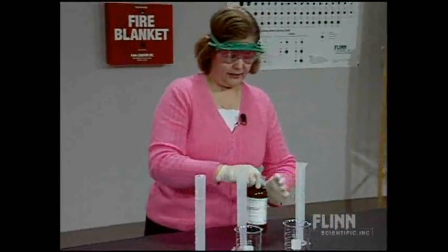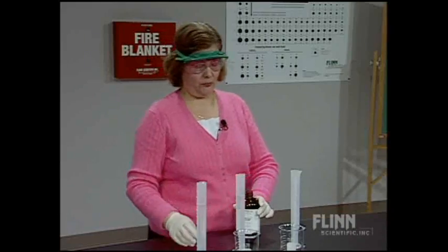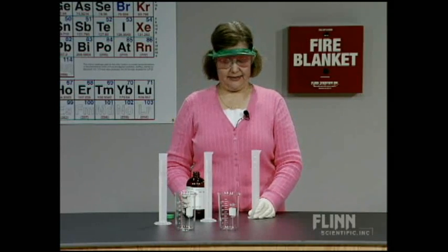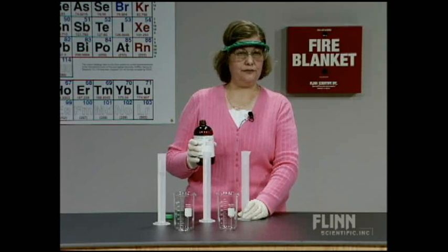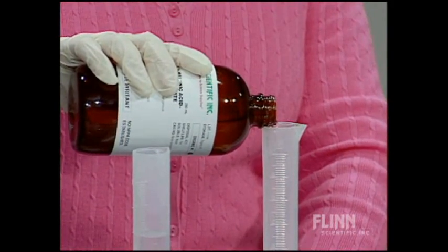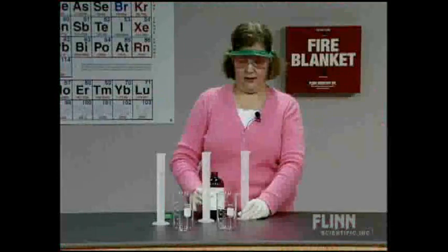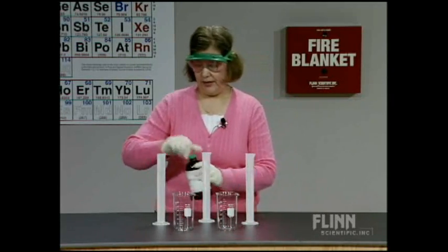And then my third reactant is actually a mixture. It has some starch in it, so that might give you a clue as to what we're going to see. It has malonic acid. Malonic acid is an organic carboxylic acid. It's a diacid. And we also have some manganese sulfate, manganese 2 cations. And the manganese is going to be a catalyst for this reaction. So again, I need equal amounts, 80 milliliters of all. And that one I think I got pretty good. That's good.